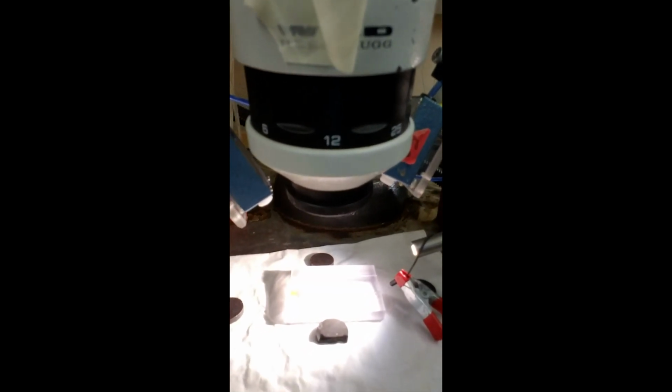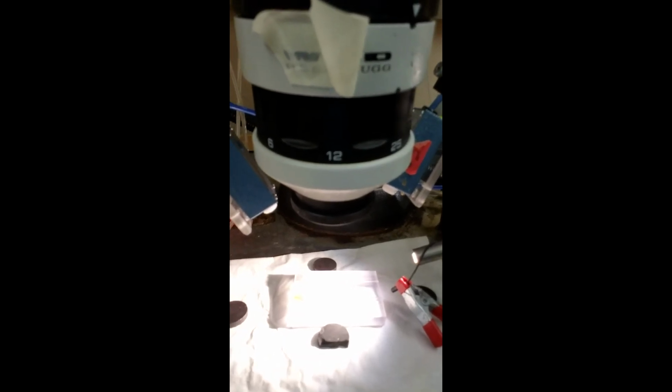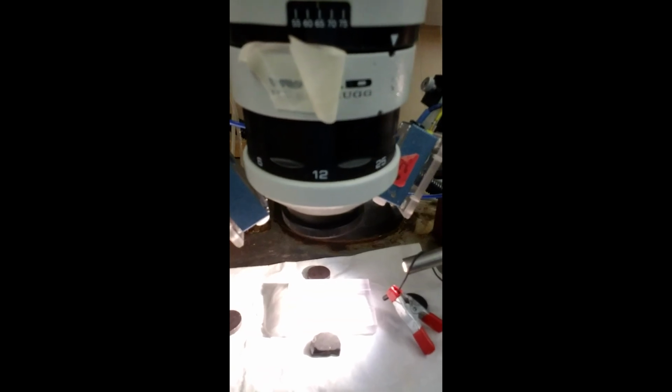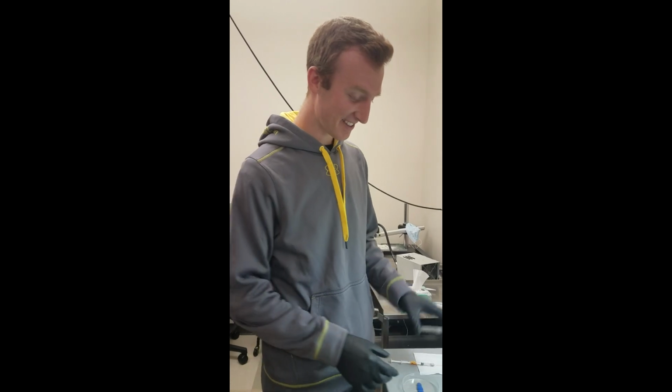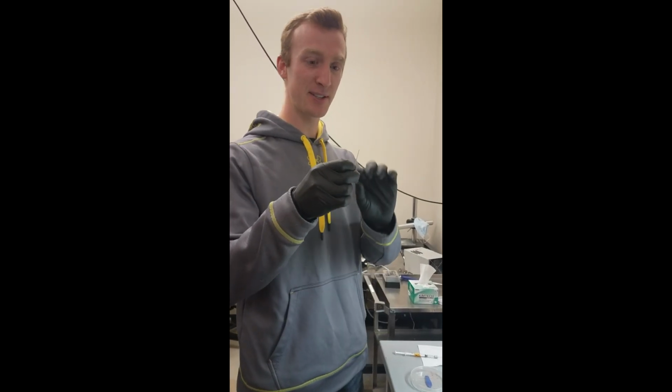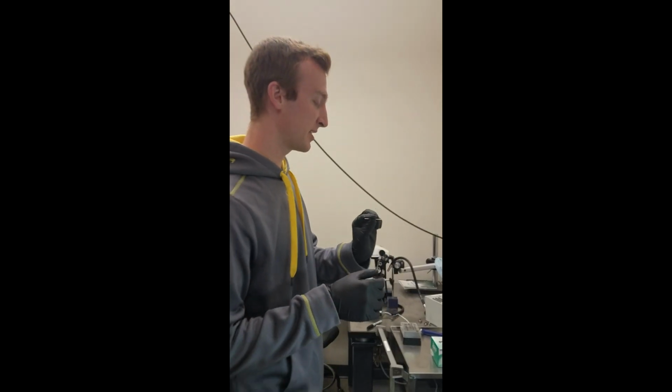But on the highest magnification, you want to clip it to about 2 ticks wide. And I just use this to clip it, and then it's at the right diameter that you can use it on the injection machine. Now that you have clipped the tip of your injection needle, the next step is to prepare it and put it on the injection machine.